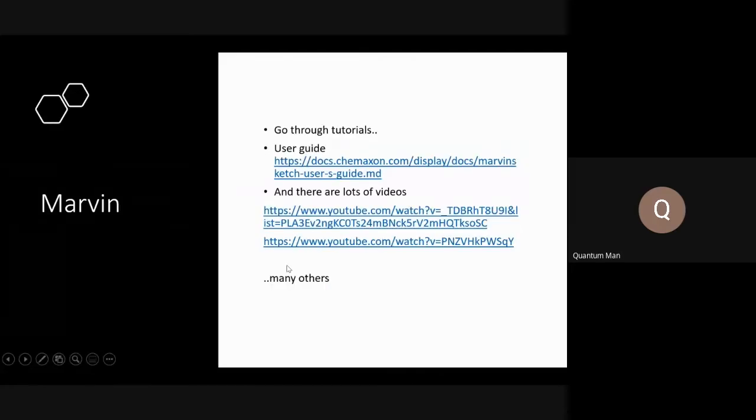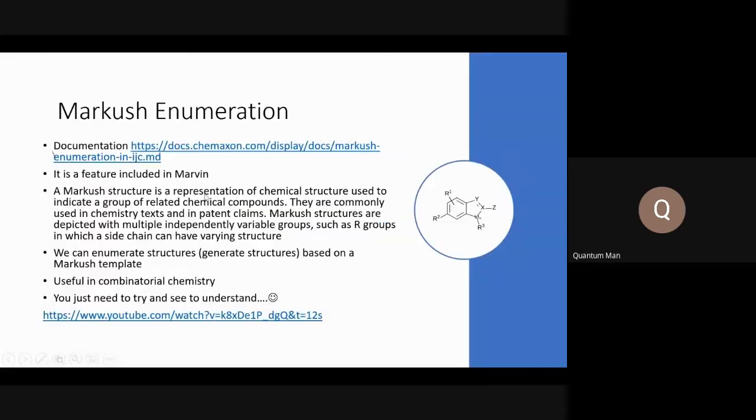So the first thing is Marvin. There are a lot of tutorials on the internet, on the web, on YouTube. Very, very good tutorials. There's a user guide. So you can go through one by one, and there are of course lots of videos related to Marvin.